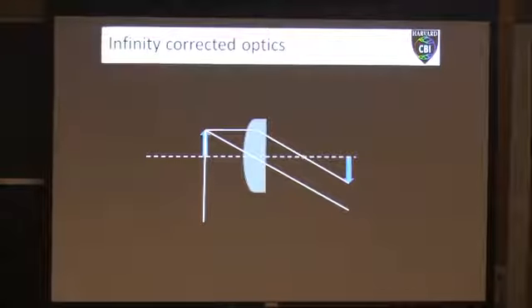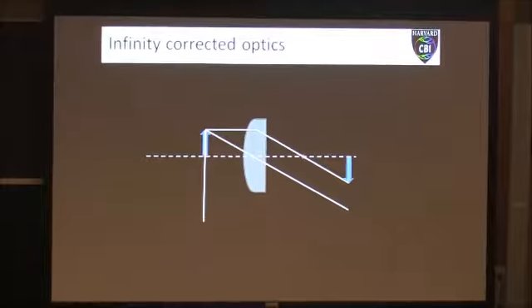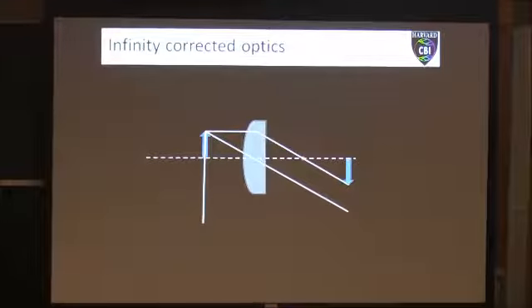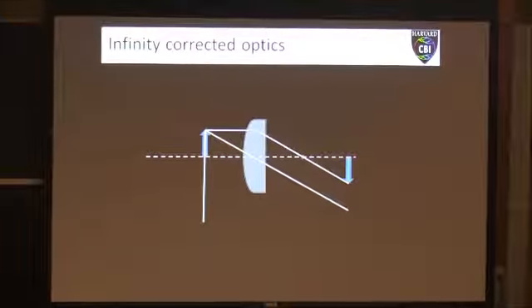They're parallel, right? So this is the really interesting thing about a microscope objective. As long as your sample, or the object that you're imaging, is sitting right at the focal point where it has to be for it to come into focus in the microscope, the light coming out of the back of your objective is actually just a whole bunch of parallel rays that you would never be able to image. Okay?